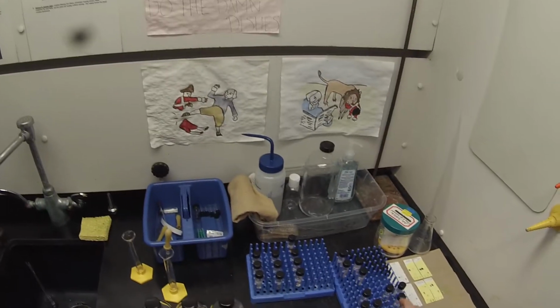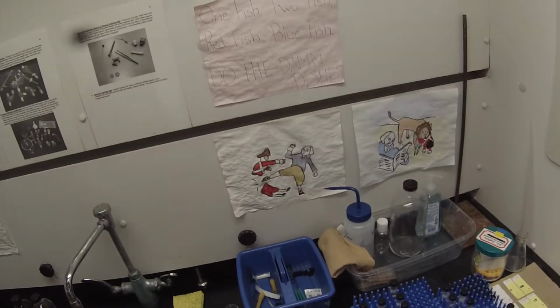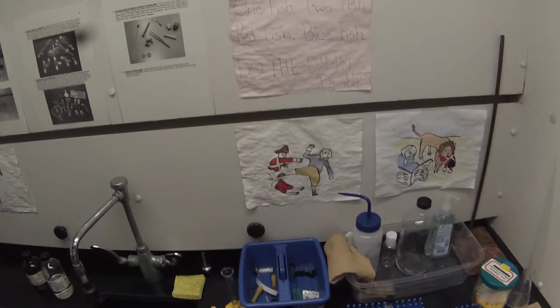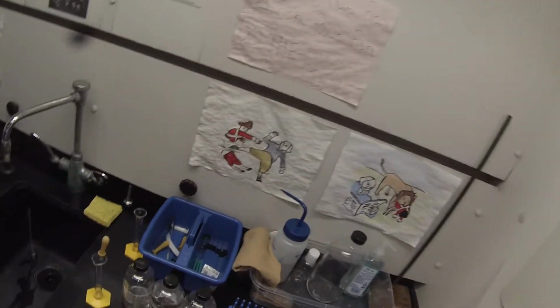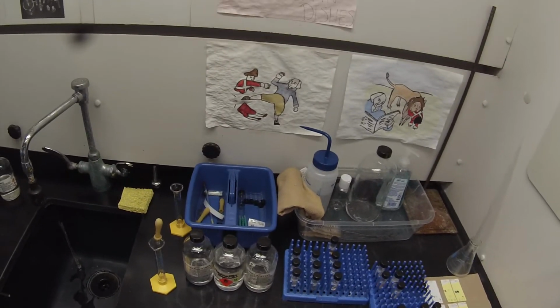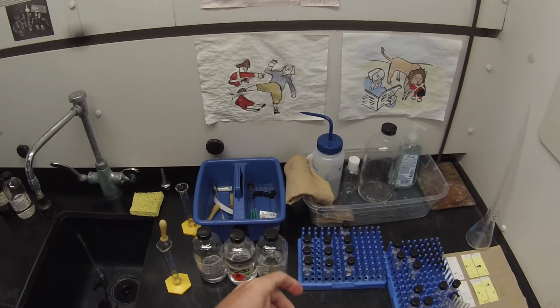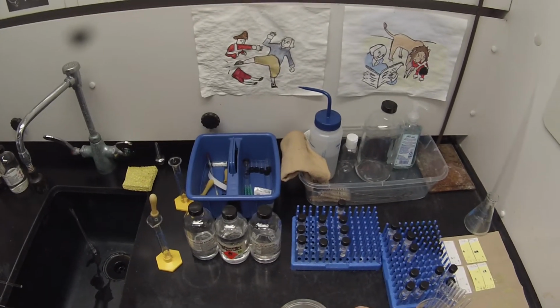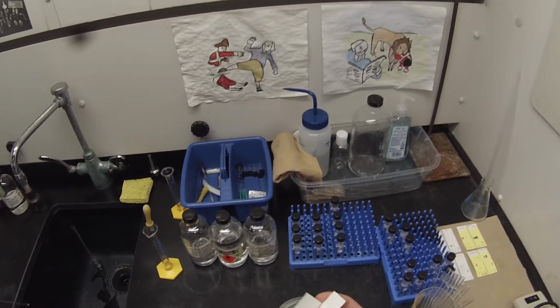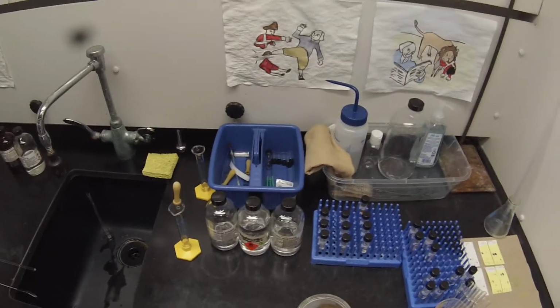So we've analyzed our crude extracts by GC mass spec. Another way that we could analyze them is by thin layer chromatography. The thin layer chromatography plates that we use here are silica gel. So you want to handle them by the edges as much as possible. Avoid getting a fingerprint on the front. So I'm going to need 3 of these, one for each of the materials.